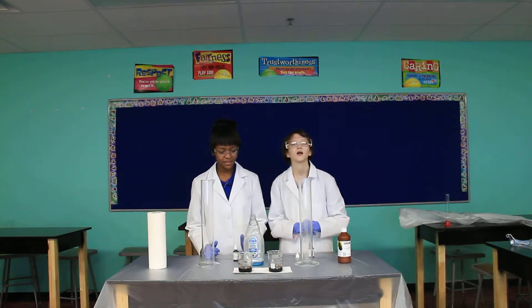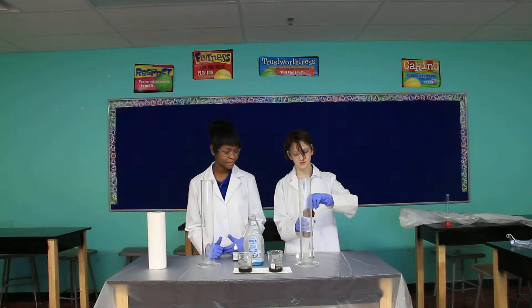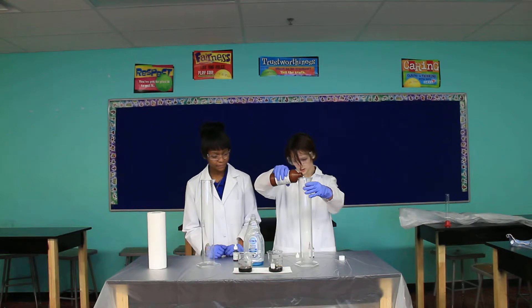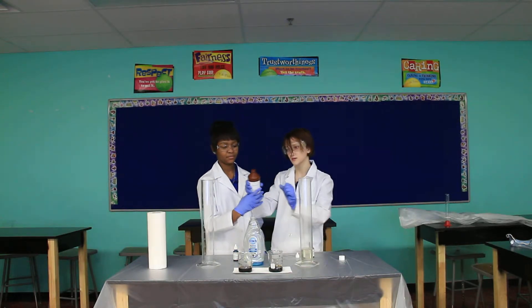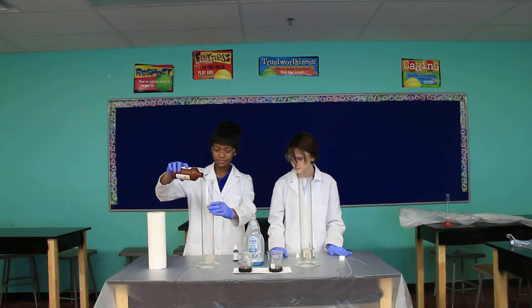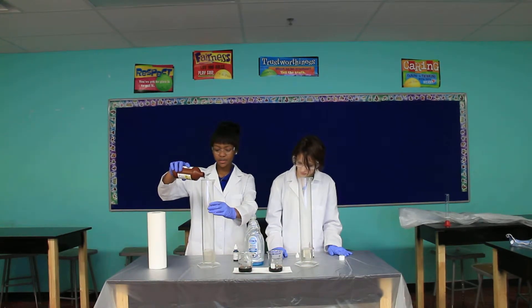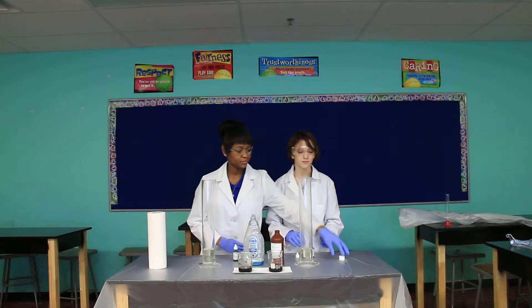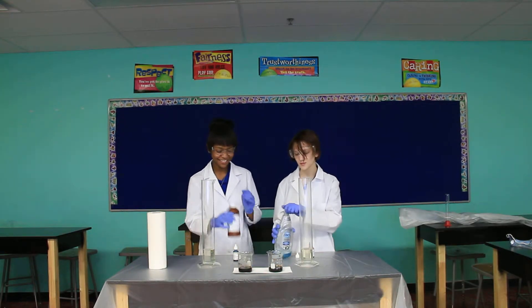All right, let's see. So we start off by pouring the hydrogen peroxide into the graduated cylinder. Make sure to wear gloves and safety goggles because safety is always important and this stuff is dangerous. We're going to put about 200 milliliters in. Put the cap back on — don't spill it everywhere.